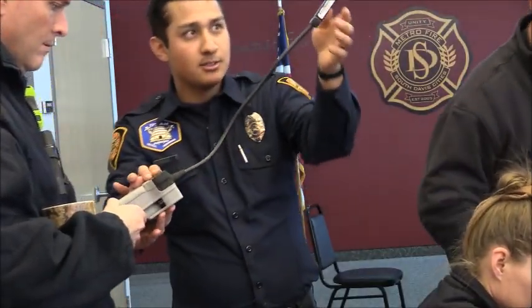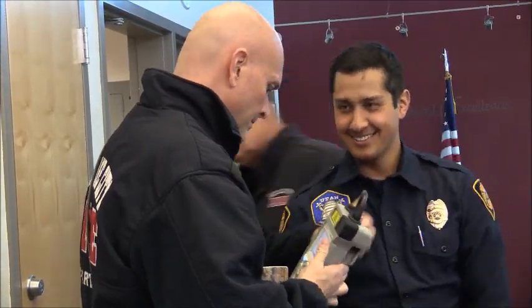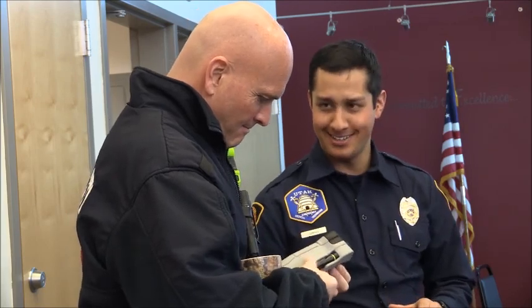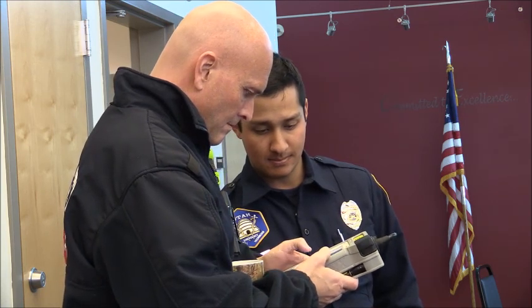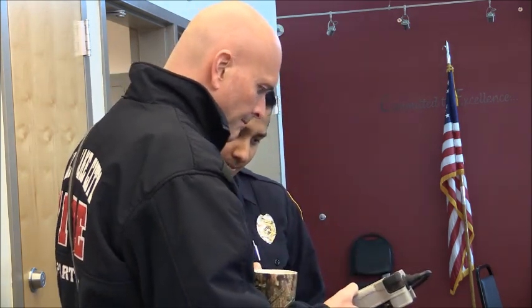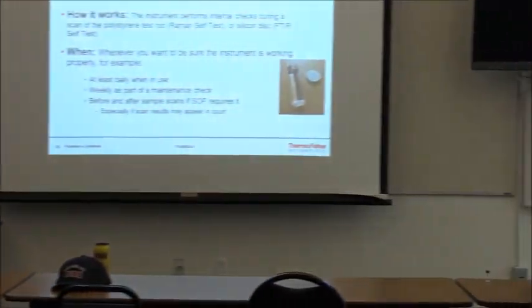What did it say? Oh, so you didn't do a self-test. So what you did was basically you just took a sample. That's all. Well, then we'll pick it up. How do we do over here? Did you do the self-test? Did it say pass or fail? Or did it say polystyrene? So you didn't do the self-test, you just did a test.